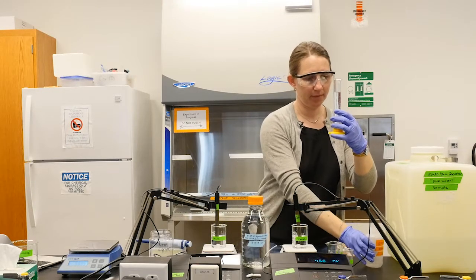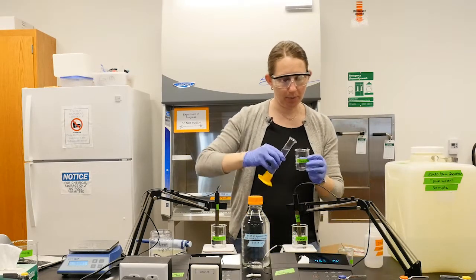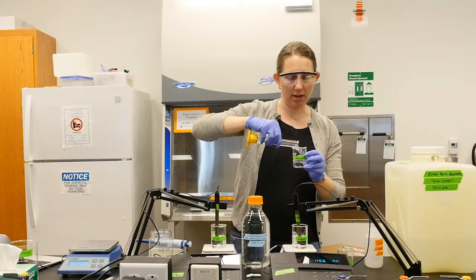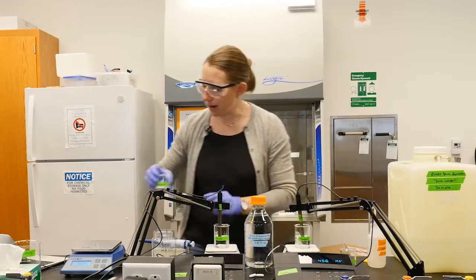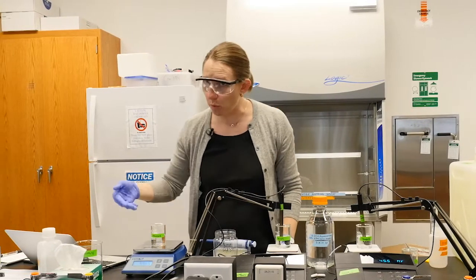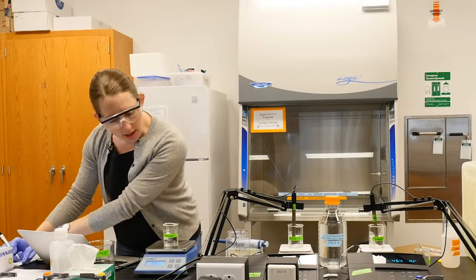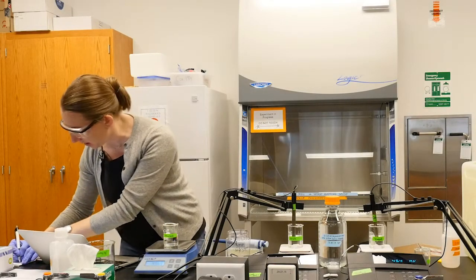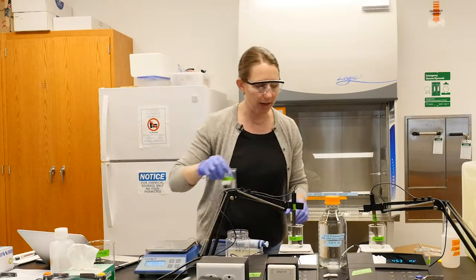All right. So we've got 50 milliliters of our standard. We'll pour that in our labeled standard beaker. Bring that back over to our balance, and we'll record that weight as our very accurate measure of how much standard we're measuring here. So 49.65 grams. All right, that one is ready to go.